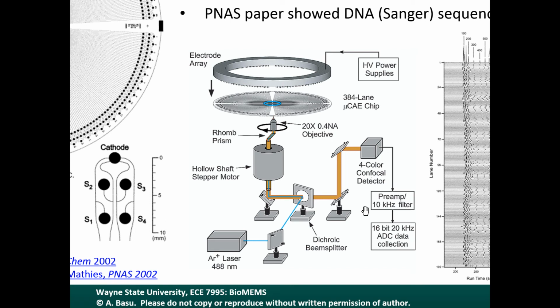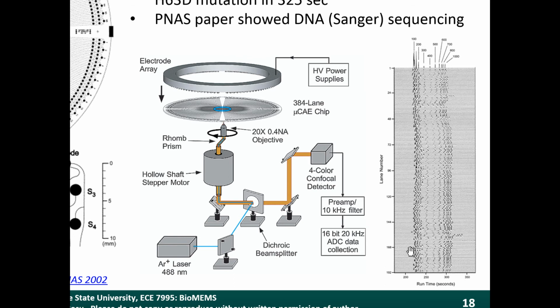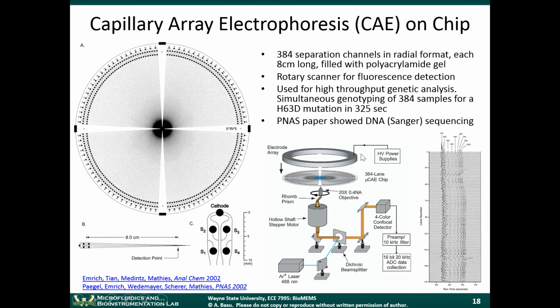So they showed these results that you can separate 384 channels at once. You got some very nice results there. So the rotation doesn't impact your separation? No, that's a good question. Yeah, that's a really good question.